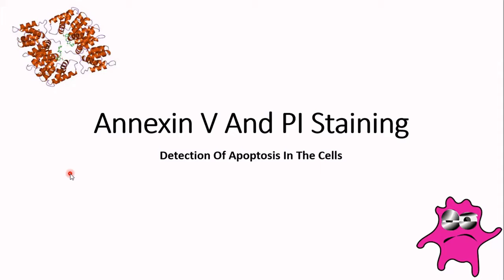So in this video I am going to explain the annexine 5 and propydium iodide staining of the cells, which is a very important technique in the field of cell biology where we want to detect whether the given cells are doing apoptosis or not. So to detect apoptosis, we are using which staining? Annexine 5 and PI, and this technique we are using for the detection of apoptosis in the given cells.